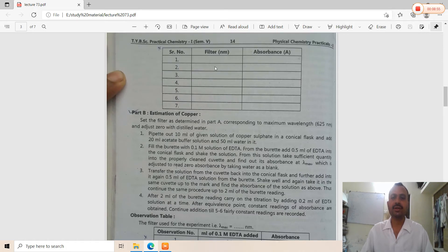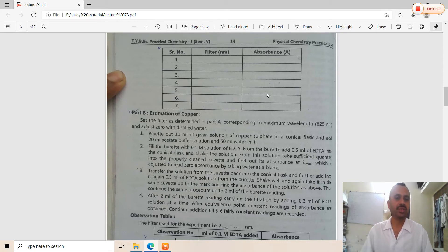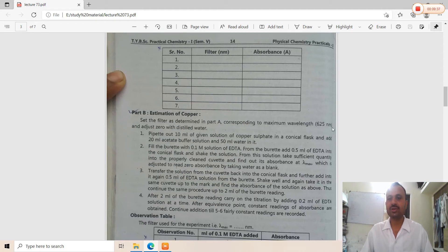The filter wavelengths used are 420, 460, 500, 570, 610, 660, and 710 nm. Record the corresponding absorbance for each filter. Select the wavelength — that is, the lambda max — where the highest absorbance value is obtained, as this corresponds to the highest sensitivity for copper concentration estimation. The selected wavelength is typically around 625 nm, though different values may be obtained.